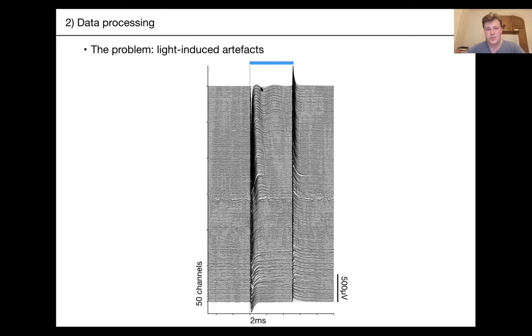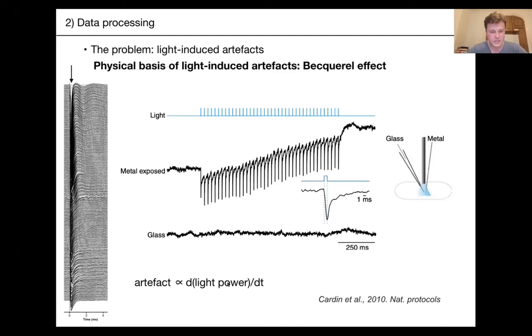You need to be aware of these artifacts and get rid of them. In this case the light is a square pulse. These artifacts are proportional to the first derivative of the light power with respect to time — so if you have a slow ramping onset, you will massively decrease the size of the artifact. But you might not want to do that if you care about precise spike timing, such as when doing optotagging. You need to play with this yourself and find some middle ground.